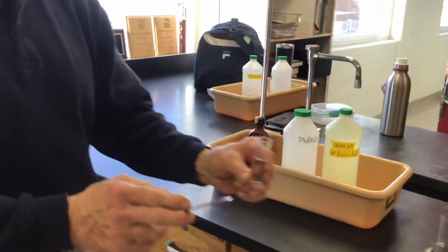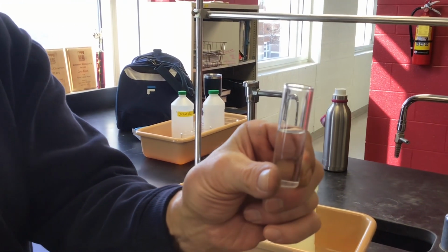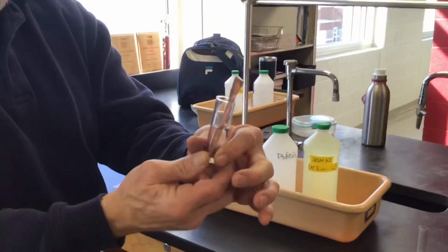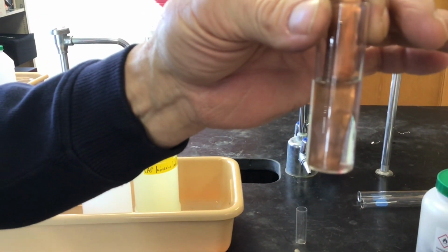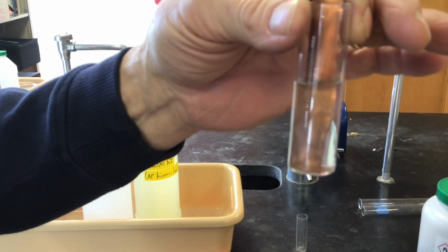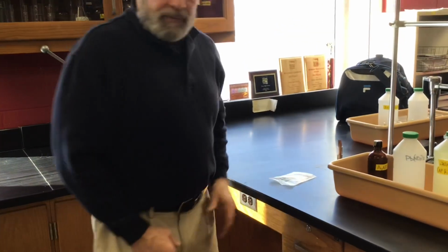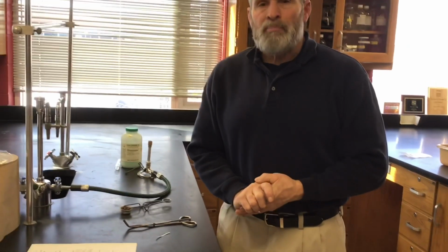Right, so copper metal. This is aqueous silver nitrate. You have silver ions and nitrate ions dissolved in the water. And now we're going to just drop the copper in, and we'll let it sit. As Mr. Moore said, it's kind of slow, so it takes time. So we'll start it first, and we'll come back to that.